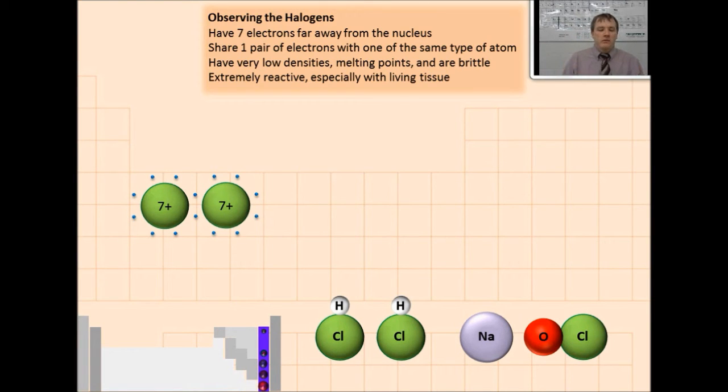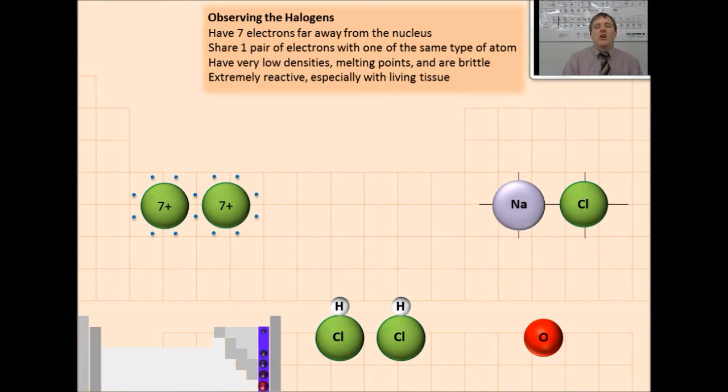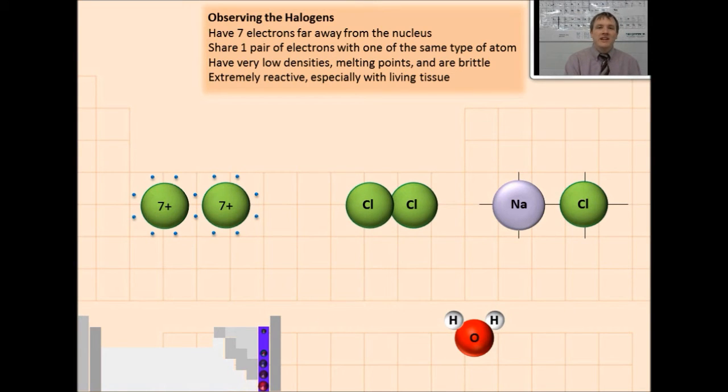And here's what's going to form. First off, we're going to get salt, sodium chloride. This is the same as table salt. That substance is not very dangerous. Another substance we're going to get is water, H2O. That substance also is not very dangerous. But the third substance that we get is chlorine gas.